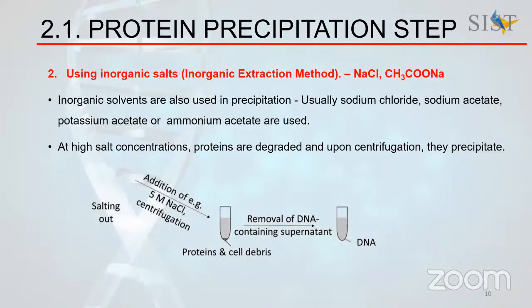So here what happens is now this lysate, as in the aqueous form, doesn't have any other contaminants. It mainly has DNA, right? So we have to get the DNA in pellet form first so that it only has DNA. We shouldn't get the DNA in an impure manner because it shouldn't have any other contaminants. In order to do that, we pellet the DNA, all right?